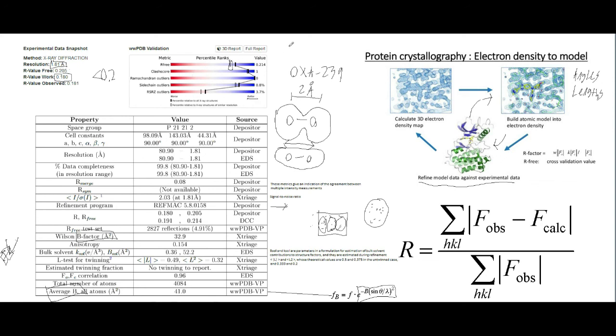Clash score, which is just telling us if we have two side chains from different parts of the protein, clash score just means that they're a little bit closer together than what we would normally like. Ramachandran outliers are the bond angles. So you see on mine there are 0 Ramachandran outliers, which means that as I went through the real space alignments, I was able to get the bond angles, the phi and psi bond angles.